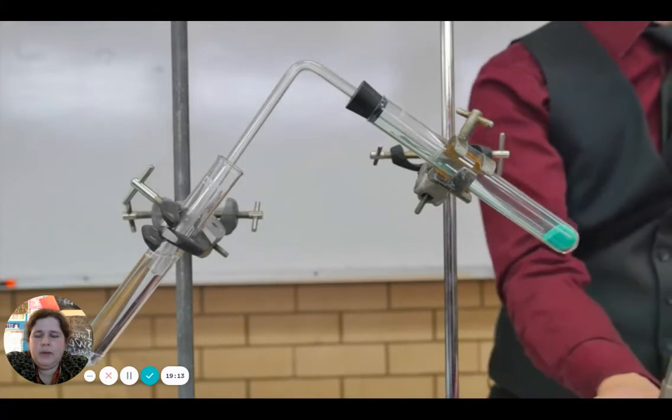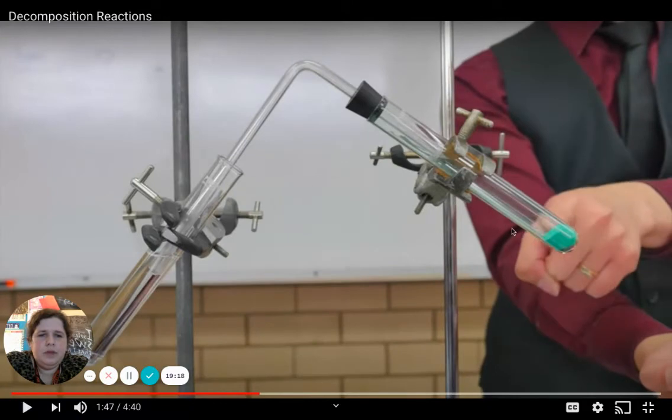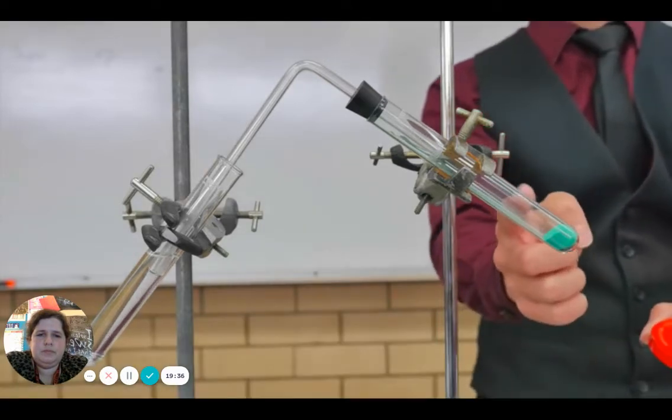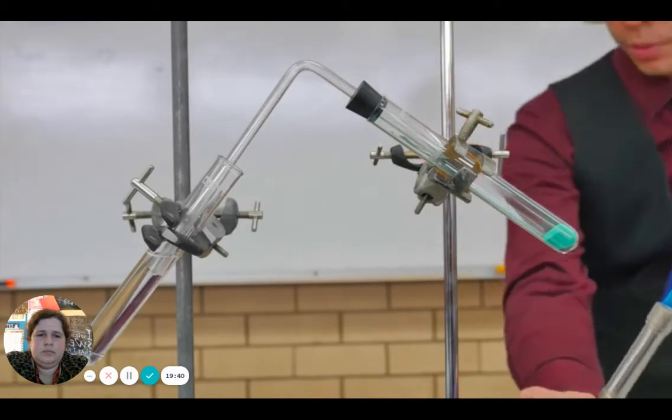Okay, we see a few bubbles coming. Can you see anything changes? No, I think. Notice the original color of the copper carbonate. It's like a greenish color, sort of like the Statue of Liberty, maybe. The lime water is just clear. I think what's happening is that maybe just the air inside is also expanding, so it's pushing out. So when it starts reacting, you'll know.